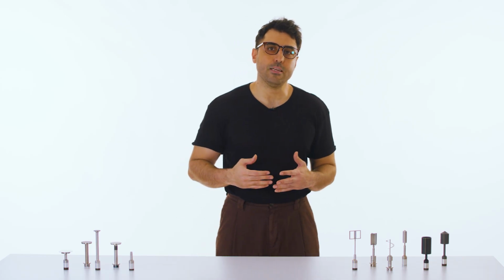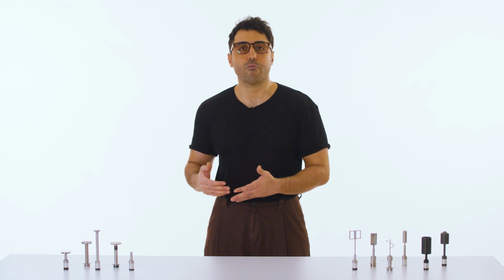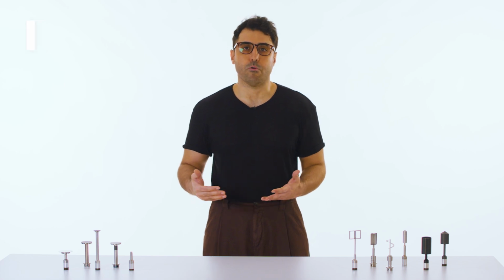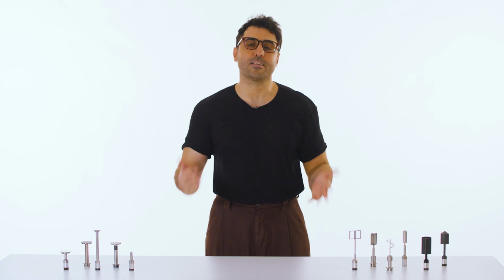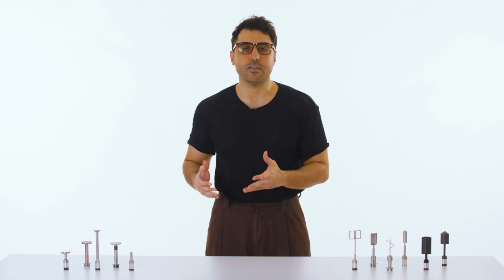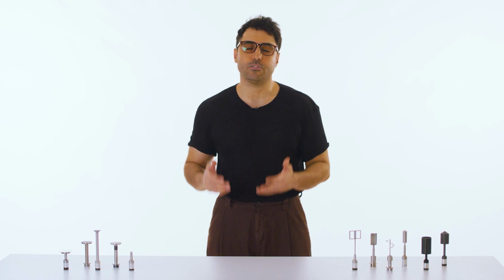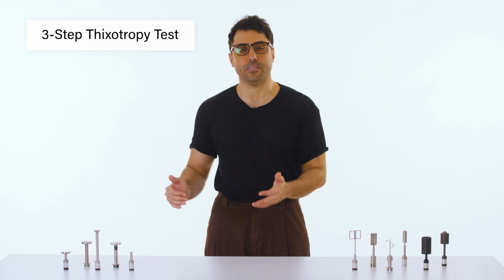You can use these pre-tests to establish a consistent initial state before running a flow ramp loop, or, as mentioned in the previous episode, to achieve more reproducible static yield stress measurements. Now, to assess thixotropy, there is a method that, in a sense, builds this idea directly into the test. It erases the shear history and establishes a constant initial condition. We call it the three-step thixotropy test.